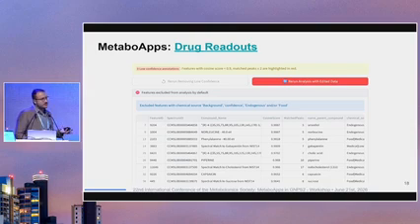We have at least 2 matched peaks, and if you have anything different from that, or in this case lower than that, it's going to be highlighted in red on the table. In this case, we have 0 low annotations. You can always change those settings. Those are the default ones. It's not always that you can get all the mass spectra data to be 90% confident, so be aware of that.